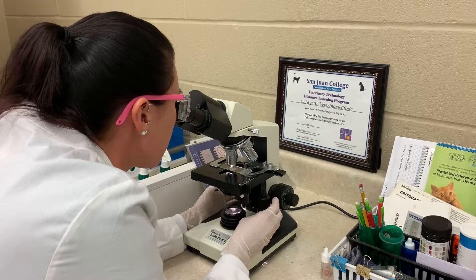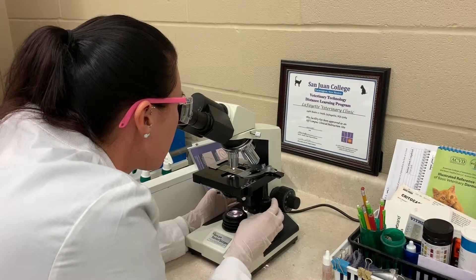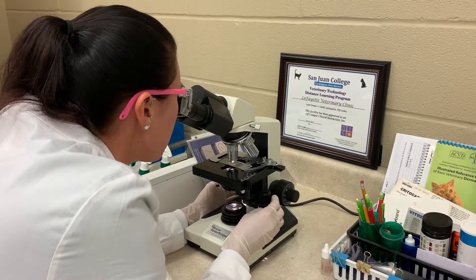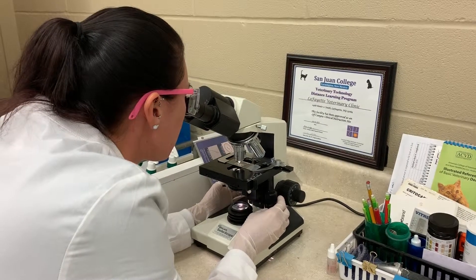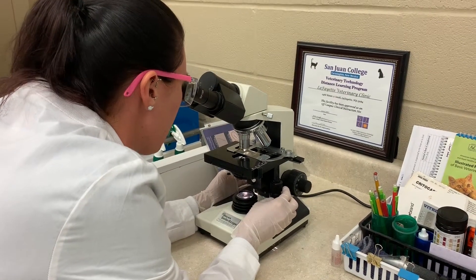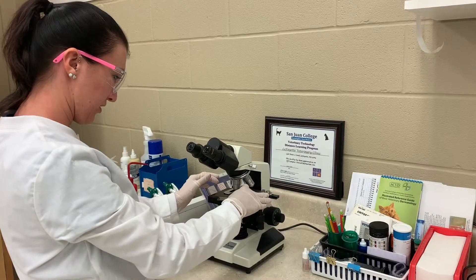I do not see any parasites. Now that we've scanned the whole slide, no parasites seen. I didn't see any, so I'll go ahead and record that in the patient's record.